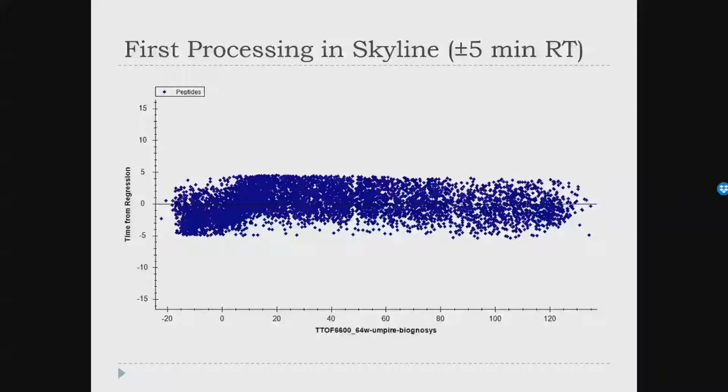I guess these are the IRT scores. Ben explained that we don't start at 0. IRT somehow goes from like -20 to 120 or so. And so these are the IRT scores, and that led us to predict some time that we would see these peptides. And then in the DIA data, this is extracted from DIA data, these are the actual times that we saw these things. And I looked at this and said, oh, I think there's a problem. And why did I say that?